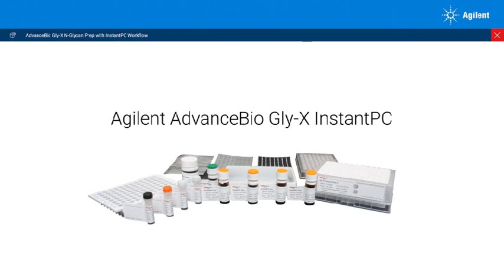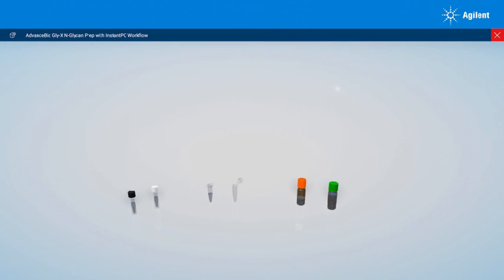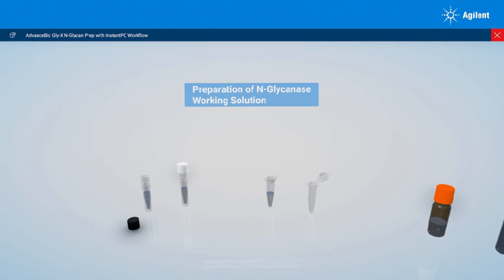Welcome to a video tutorial on how to use the Agilent AdvanceBio Gly-X N-glycan prep with InstantPC workflow. We start with preparation of N-glycanase working solution, also known as PNGase F.